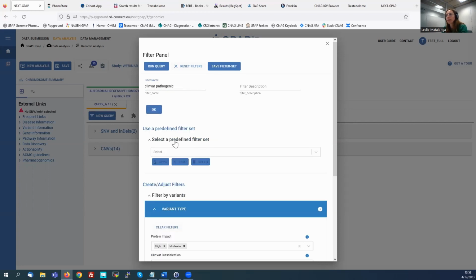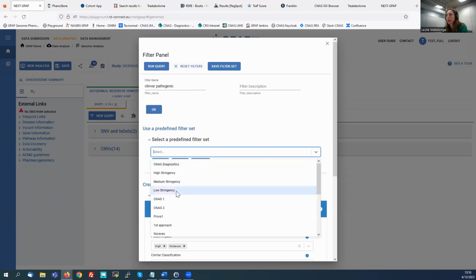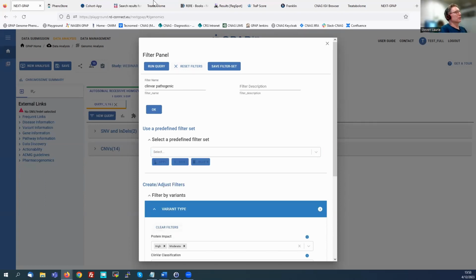And once it's saved, then it will appear in your list of preset filterings. Yeah, it's not shareable yet, but it's something that we can think about, so that you can all use the same predefined filters. And yeah, this is also something we could maybe add as well. We could add extra predefined filters ourselves, I guess, right?